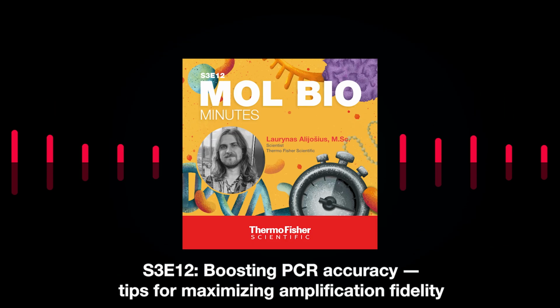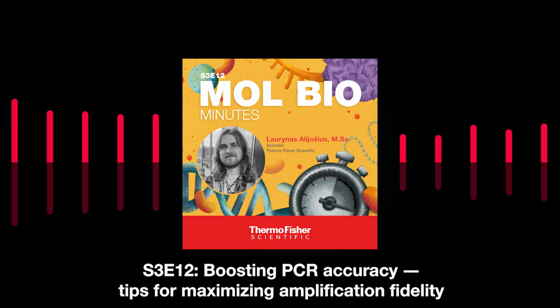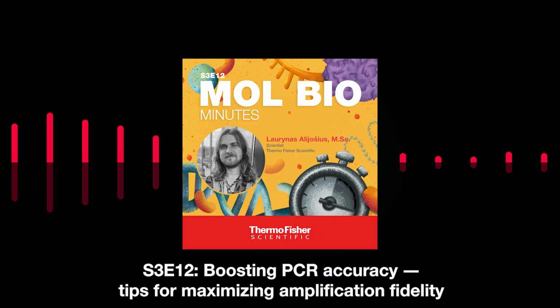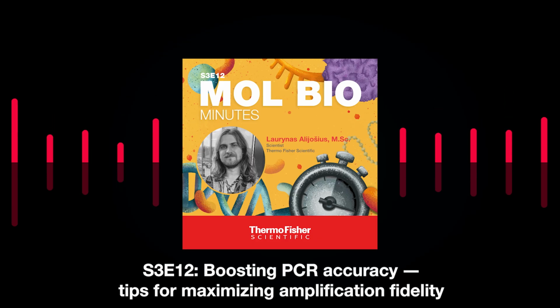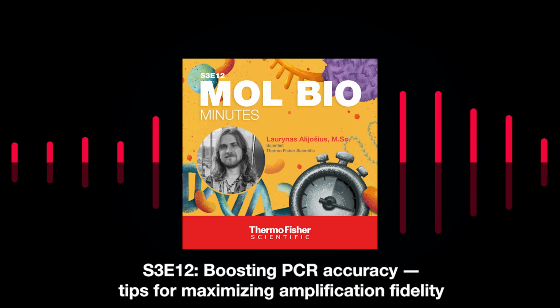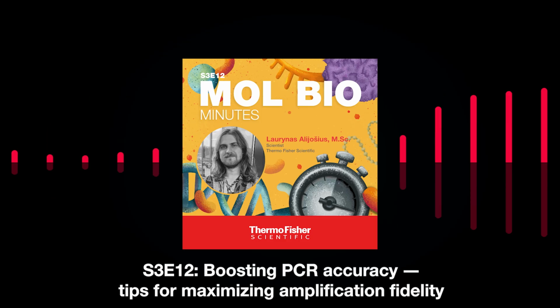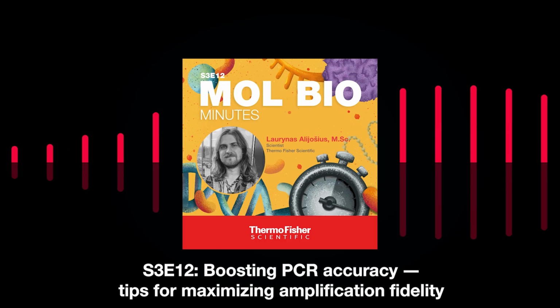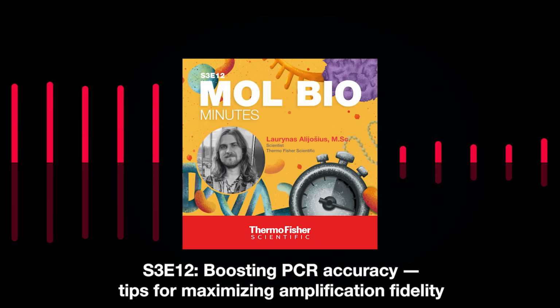The quality of another component is also important, and that important component is the DNA template. So if there are impurities in your DNA template sample, let's say some leftovers from the purification reagents or phenol or salts, all of these leftovers and impurities can impact the quality of your PCR in a negative way.